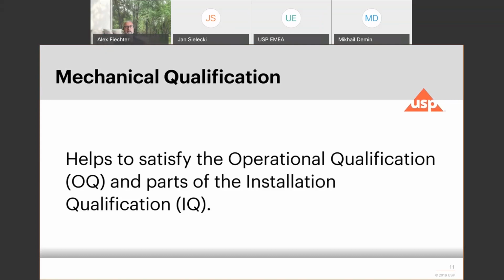So please check your equipment and accessories under IQ before you assess them with the mechanical qualification. A thorough mechanical qualification is important. And with our recommendation, before every PVT it should be done again.